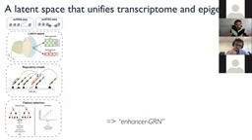All right, so these are now 2 approaches, RNA and ATAC, so it becomes a bit confusing maybe. And so we need to find ways to exploit both layers. And in the brain, I will also come to that. So the first thing we tried in this project in the eye disc was to solve an important issue when we want to link them, and that is, how do we link regions to genes? And for that, we are using this common latent space where the RNA and ATAC are projected. So now both of them have the same dimensions of virtual cells.